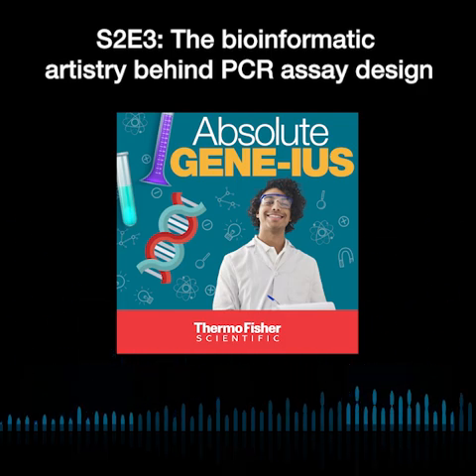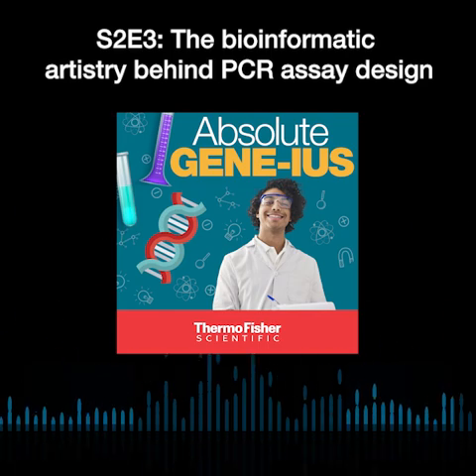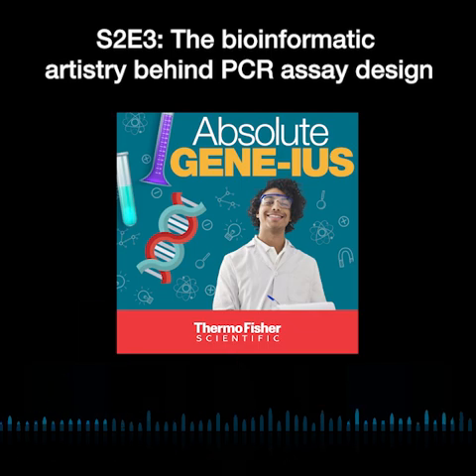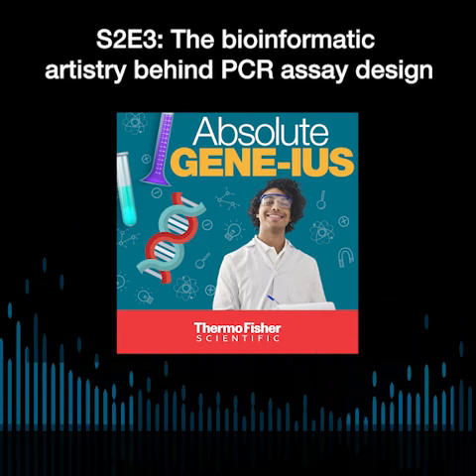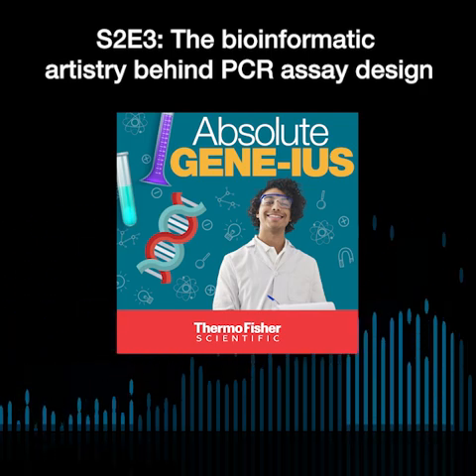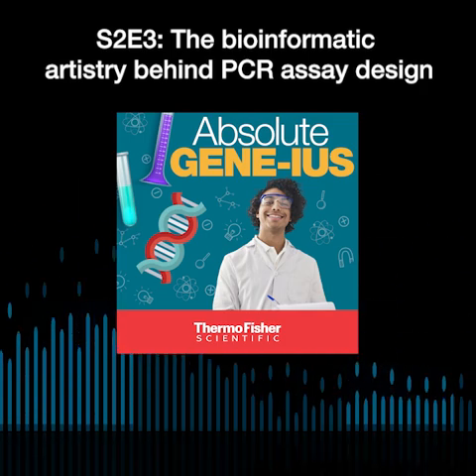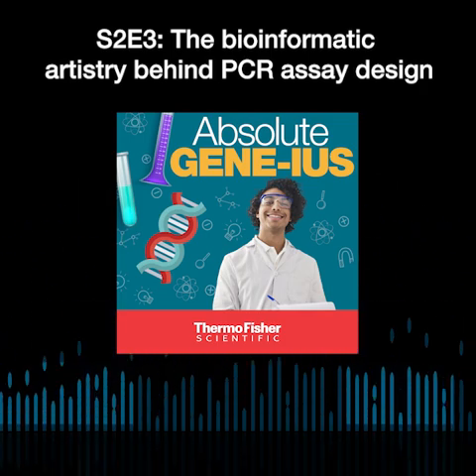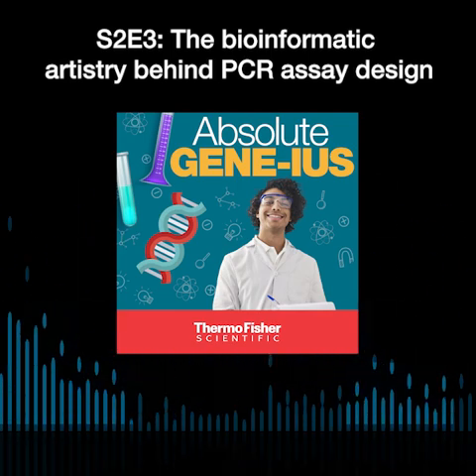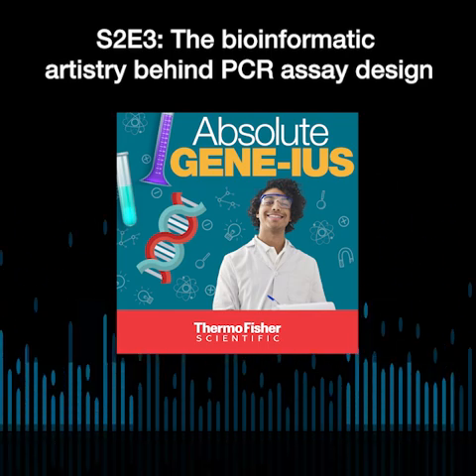Makes sense. Awesome. So you get a request in for a new assay from somebody looking to run an experiment with digital PCR. What steps do you take to get a good understanding of what's needed and how to take that from concept to an actual assay? The easiest type of request might come with a target sequence already included, but sometimes that's not the case. Sometimes they'll just give us like, hey, I want this mutation. So we might have to do a little research and figure out where this mutation is in the genome, get the target sequence, and then get a FASTA file for that target, and then we'll design for it.